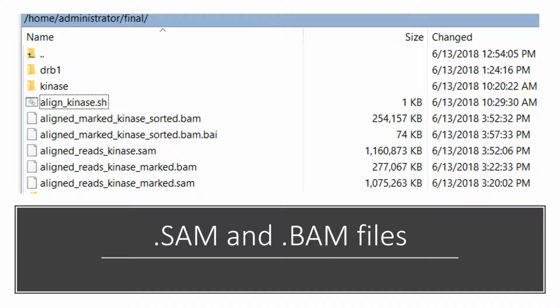Using bioinformatics tools BWA or Bowtie, here I have used BWA to analyze the alignment, and the SAM files obtained are then converted to BAM files using SAMtools. The .bam files are then processed after marking and sorting.